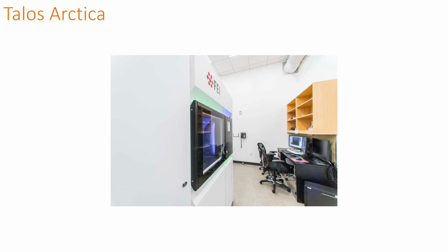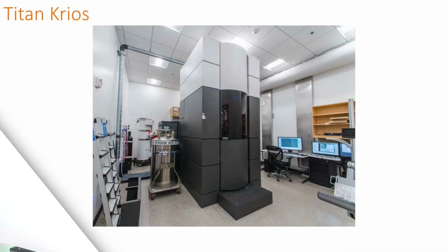If a sample looks good and the structures require slightly higher resolution, then the next step would be the Titan Krios. This is our Titan Krios. The accelerating voltage is set at 300,000 electron volts. As you can see, it is much taller compared to the Talos Arctica. And we didn't really see this liquid nitrogen tank on the previous image, but it is also attached to our microscope. And since our grids need to be maintained at liquid nitrogen temperatures, the systems are automatically refilled from these tanks.